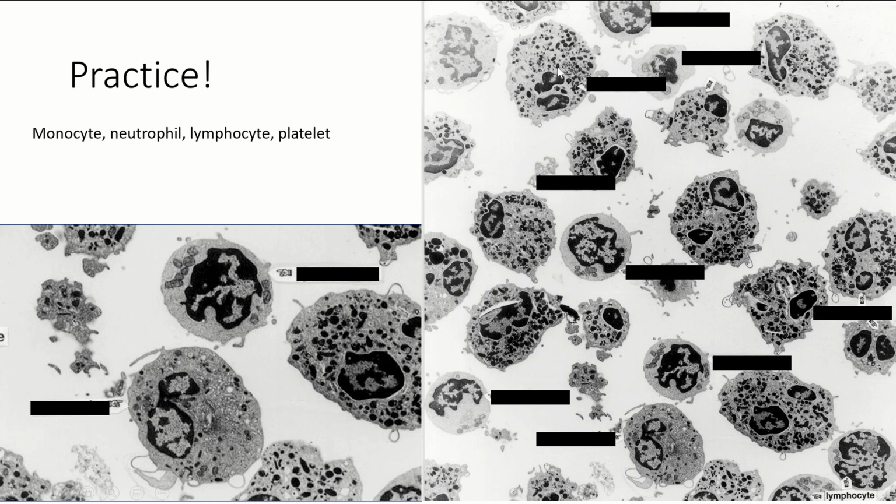So this is a neutrophil. This is a neutrophil, this is a neutrophil, this is a neutrophil, right? A lot of these, if it doesn't fit into one of those specific categories, it's going to be a neutrophil. And remember we did say that those are the most common.